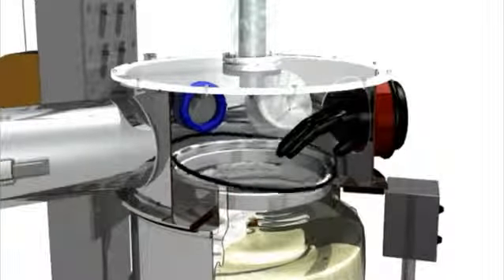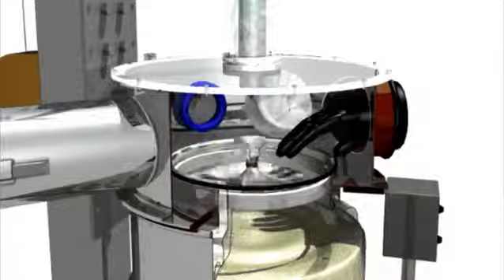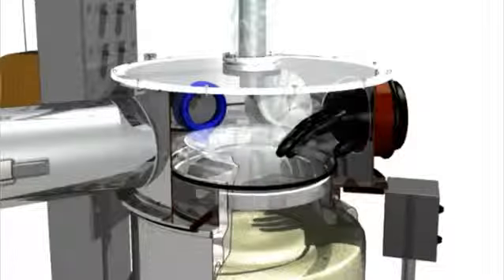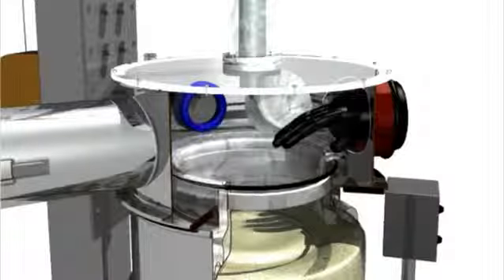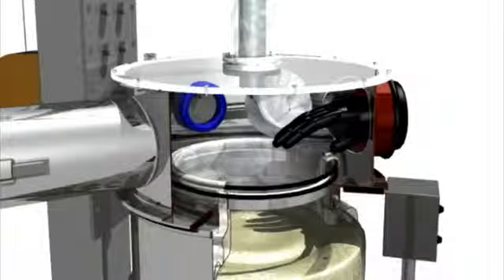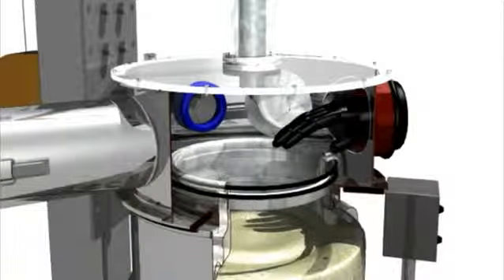This allows the operator to pull the inner liner into the isolator where it can be opened safely. The operator then pulls the inner liner over the outer liner and connects it via a second O-ring, making a double seal. The entire operation is completed under negative pressure.